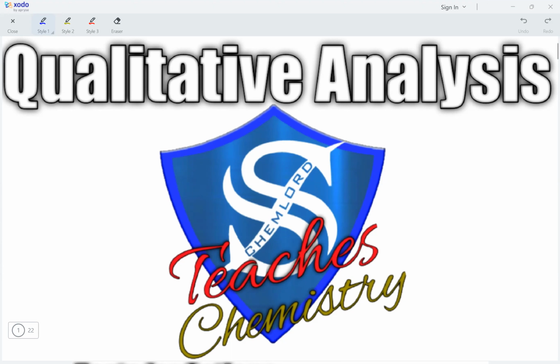So we have already looked at the test for ammonia and sulfur dioxide. Also, when testing for carbonate ions in anions, we had production of carbon dioxide gas which turned lime water milky. So out of the six gases that we need to test, three have been mentioned in the previous test for cations and anions. We will be looking at these tests again along with tests for identification of the chlorine gas, the hydrogen gas and the oxygen gas.